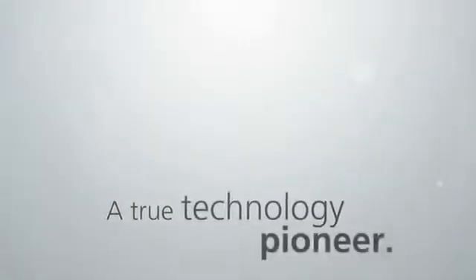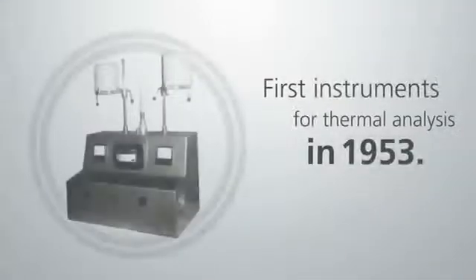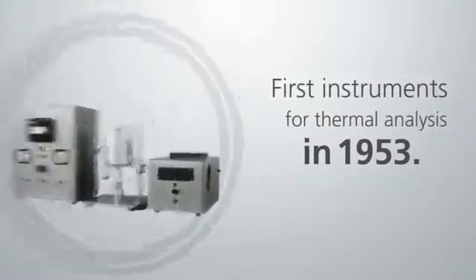Since 1873, the NETZSCH Group has been managed as a family company. Our business unit, analyzing and testing, already developed our first instruments for thermal analysis as early as 1953.